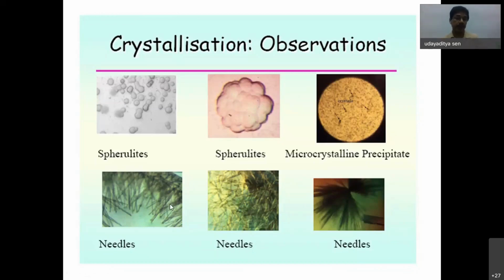Glycerol has two kinds of effects. Actually, it increases the solubility of the protein, and another thing, when it forms crystal, one protein molecule comes and sits on the nucleus maybe. So this is a diffusion control reaction. And in a diffusion control reaction, if you change the viscosity, like adding glycerol or something, the process will be slow, and you might get a better crystal or bigger crystal.